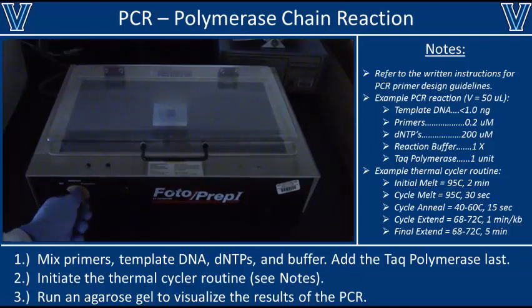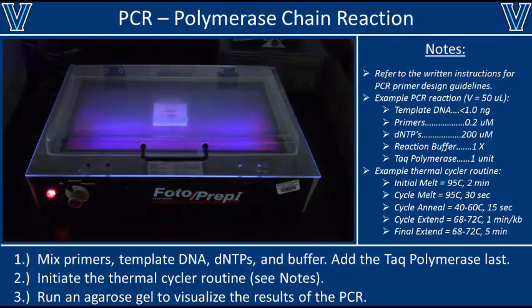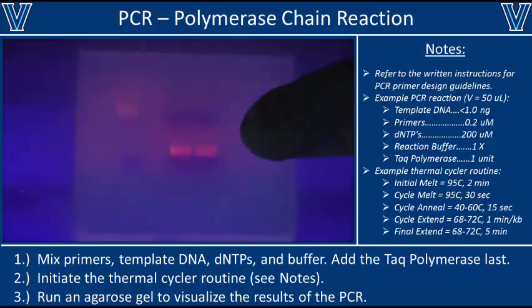Once you turn on the UV light, your DNA bands should start to fluoresce. Unfortunately, the DNA ladder appears to have degraded and is pretty useless in this gel. However, it looks like our PCR reaction worked quite well — we have two very bright bands in both of our sample lanes. If your PCR reaction hadn't worked, you'd see nothing in these lanes. The next step would be to extract these bands from the agarose gel. To see how that's done, please proceed to our video on gel extraction, or proceed directly to our video on digestion.